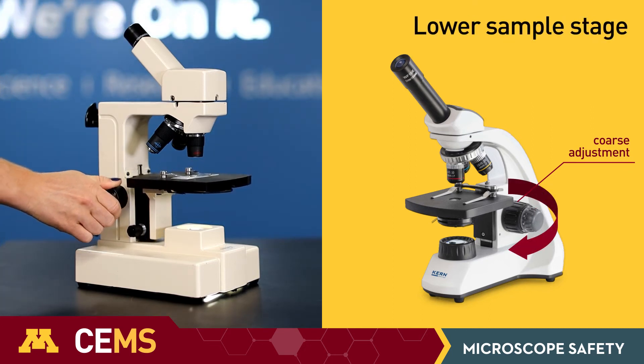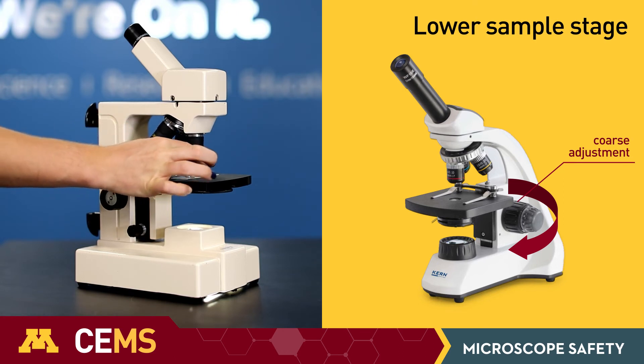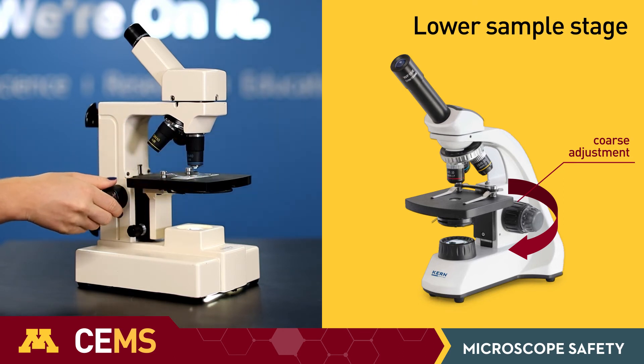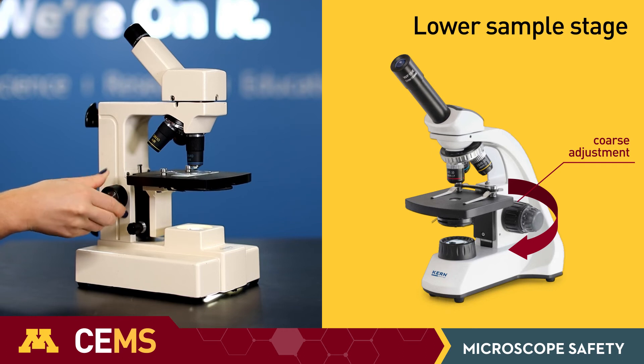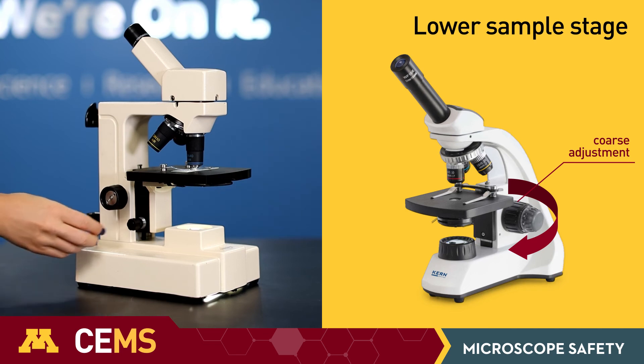When switching objectives, you always want to bring the sample stage all the way down first. Again, this ensures that the objective does not crash into the sample. Now you are ready to bring the sample stage all the way up again and then slowly lower it to focus.